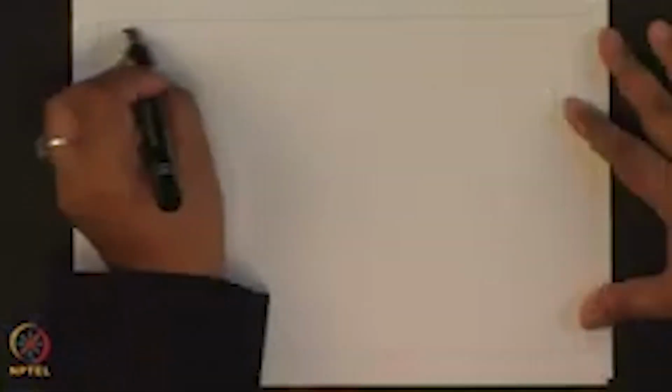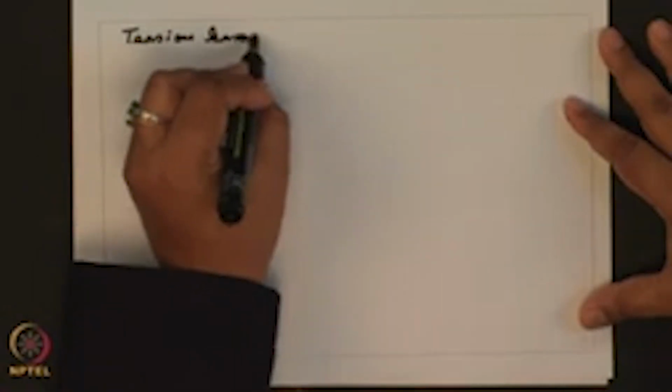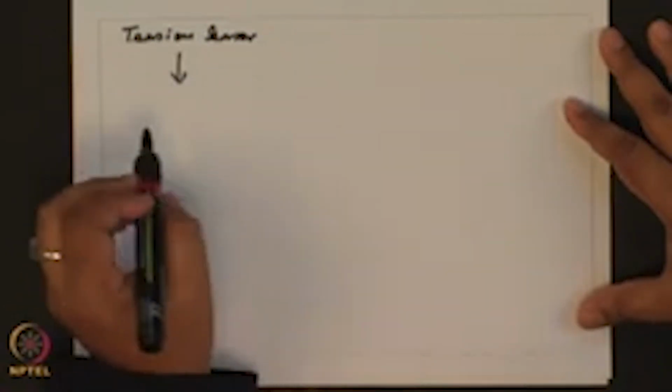to force. Okay. So, in this regard, they made use of a construct which they named the tension sensor. Okay. So, what is their tension sensor design?